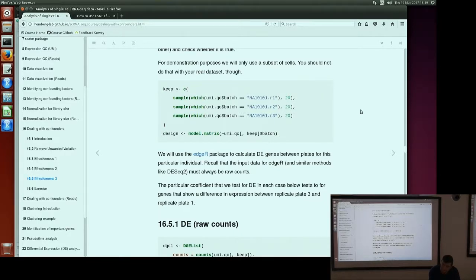So basically, you want to look at the technical variation of the gene expression between these replicas. Well, not so much assessing the technical variability, but we're saying under different normalization or adjustment approaches, some will do a better or worse job of removing this batch effect. And so one way of assessing the effect of batch for a given normalization approach, or what's left, is to say, between batches, can we find genes that are differentially expressed?